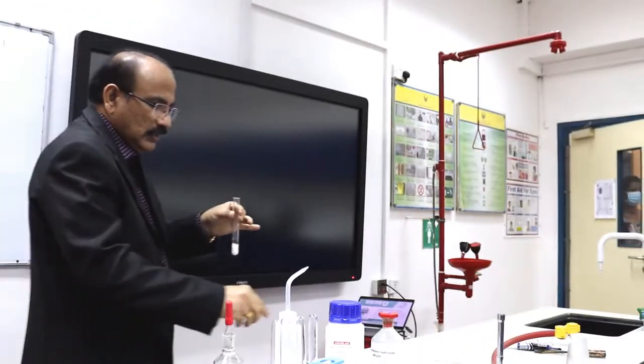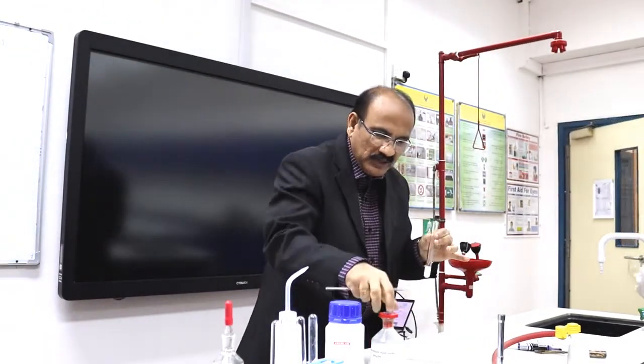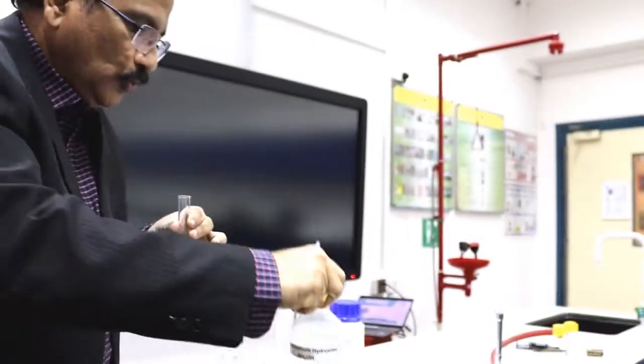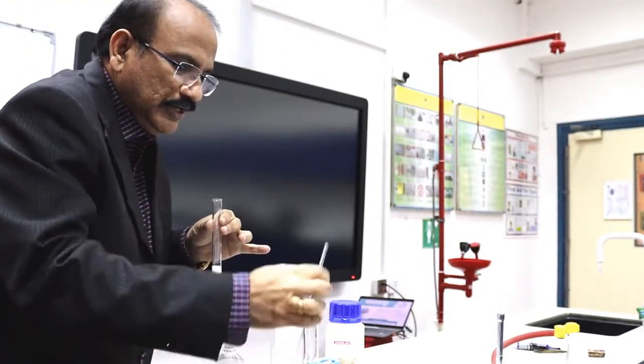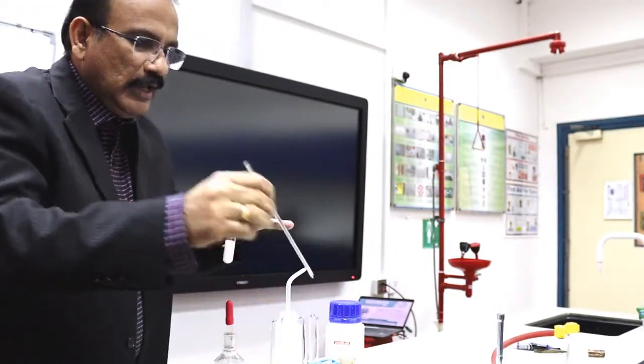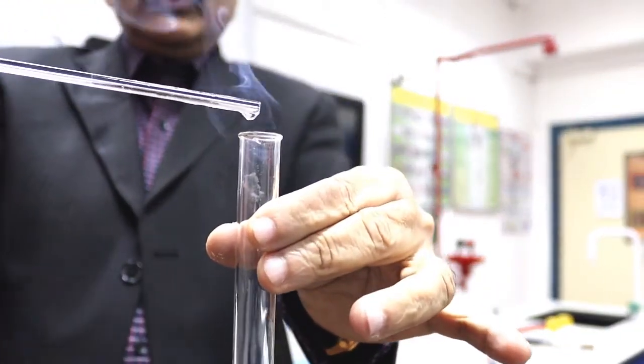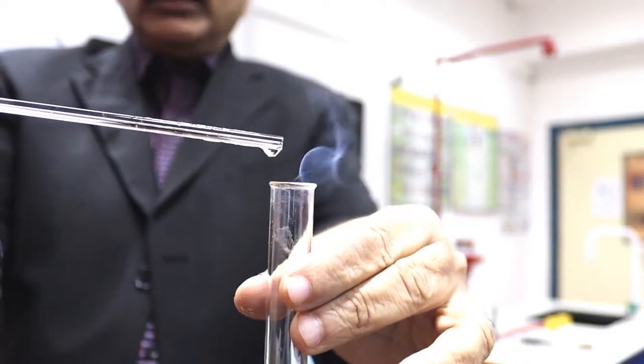Next step is we will take a bottle of ammonium hydroxide. Open the bottle, dip the glass rod, and introduce at the mouth of this one. You can see white fumes, white dense fumes are coming.